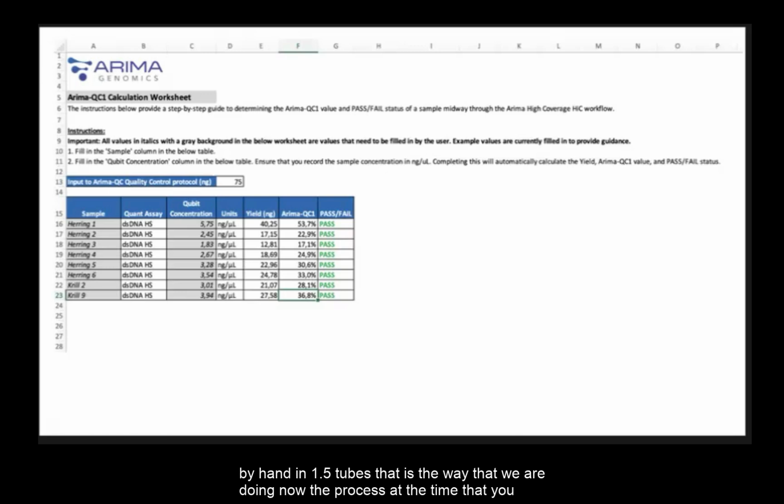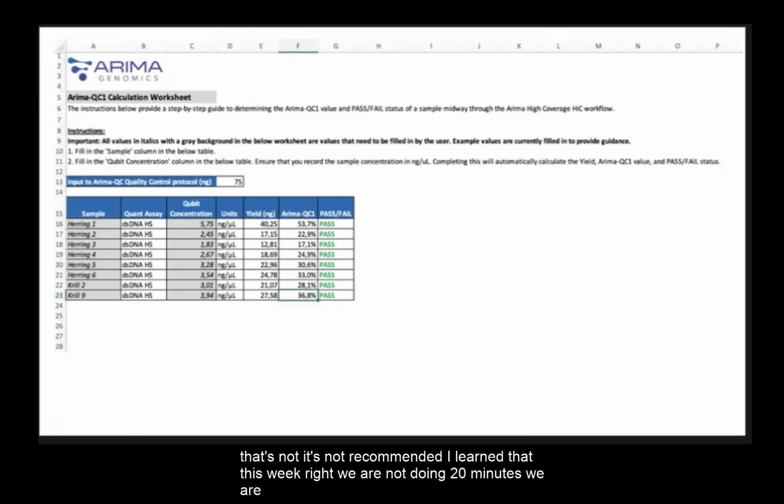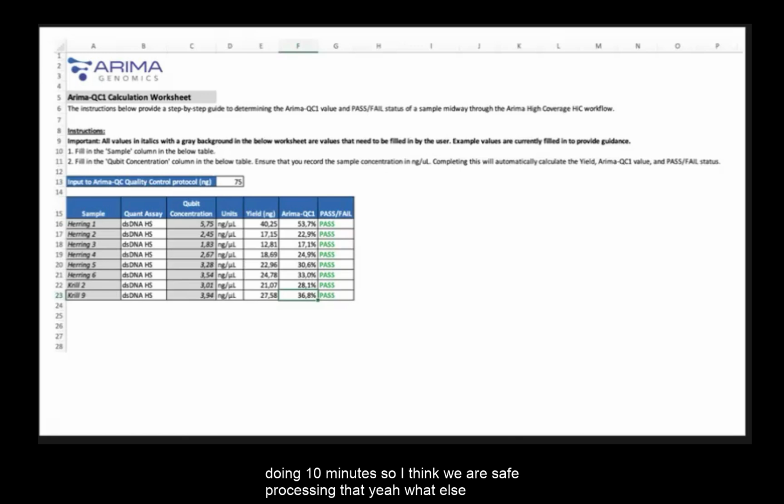At the time that you arrive at sample 15 it is more than 20 minutes. It's maybe 30 minutes of conditional solution. That's not recommended. I learned that this week, right? We are not doing 20 minutes, we are doing 10 minutes. So I think we are safe processing that.